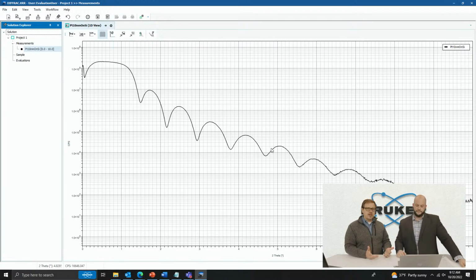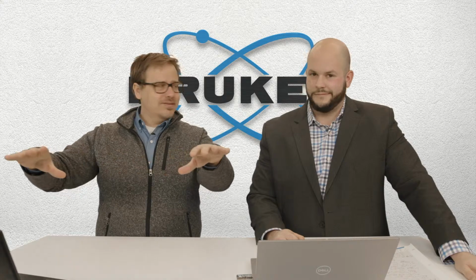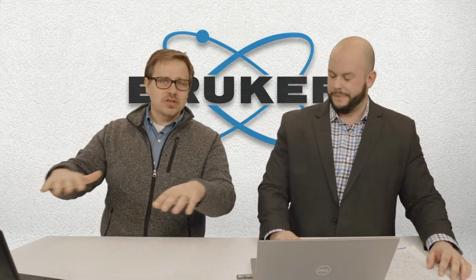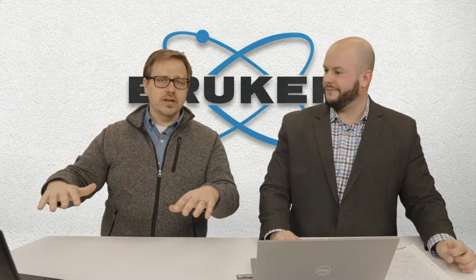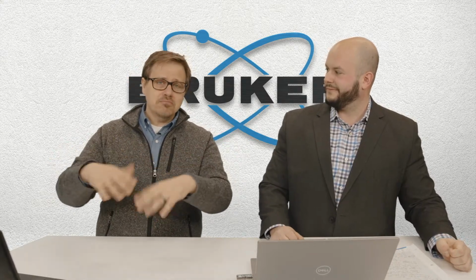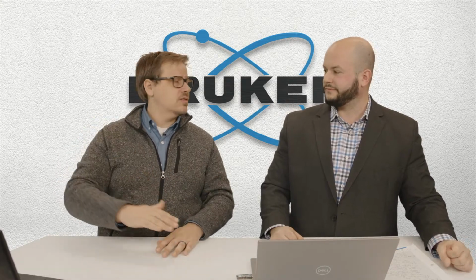The analogy I like to use here is, say that we're sitting out on the lake. Here in Wisconsin it's that fall season right now, so we get these beautiful sunsets. Sometimes you're sitting by the lake and you see the sun coming down, and if the lake is nice and still, you get really high fidelity, a lot of light coming off of that surface. That's a smooth surface, so you get that signal going over a long area. On the other hand, if the lake is rough and wavy, like a rough sample surface, you get a lot more diffuse scatter, and the intensity decays much faster.